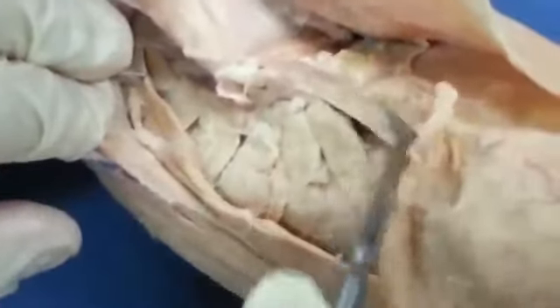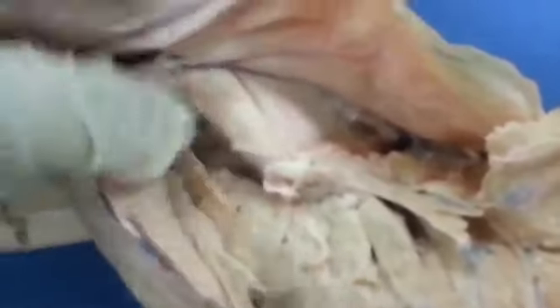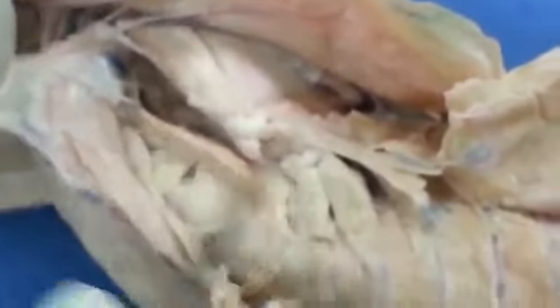Then you have the serratus ventralis. These muscles here. Very nice view again of the external intercostals. And then you have the scalenes in this area. So those would be the main muscles of the deep chest. Now we can go to the muscles of the brachium.